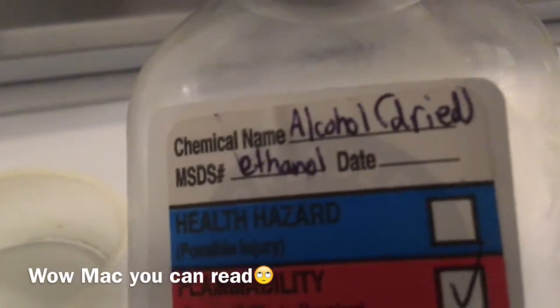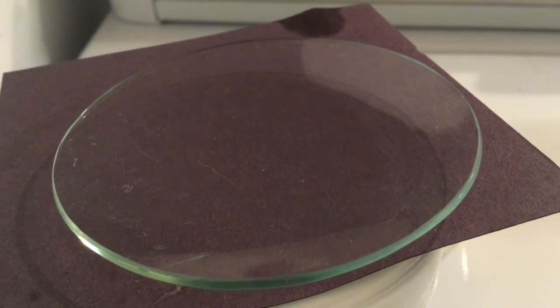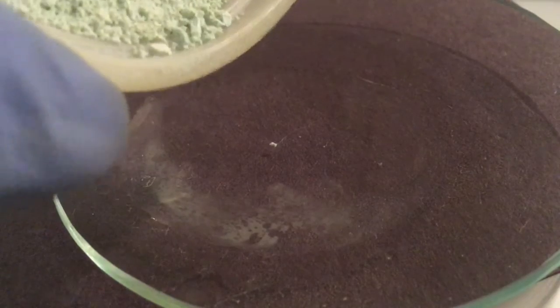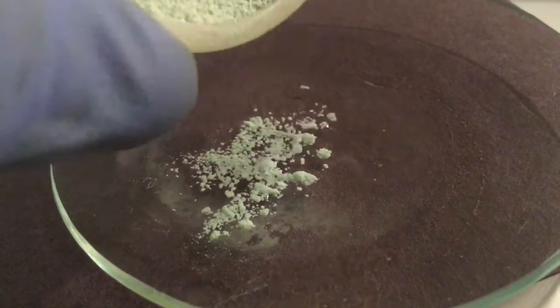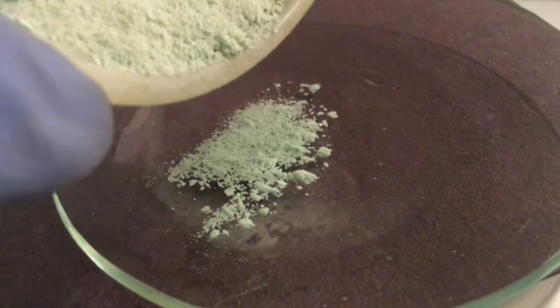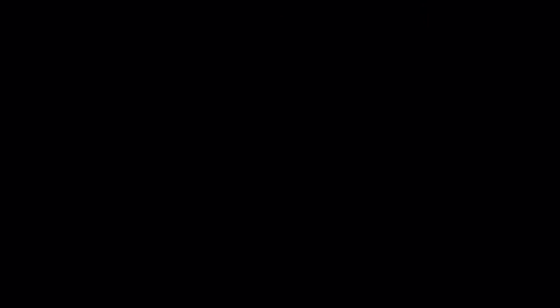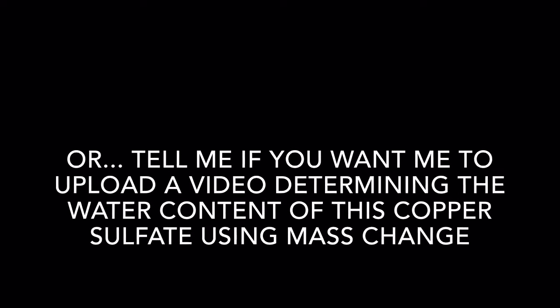Now let's test some dried ethanol. We're going to put some on this dish and drop some anhydrous copper sulfate on it. If it doesn't change color, that means it's quite anhydrous alcohol. And — wow — really no color change at all. It just got a little greener, which is really good. Here's the color comparison.